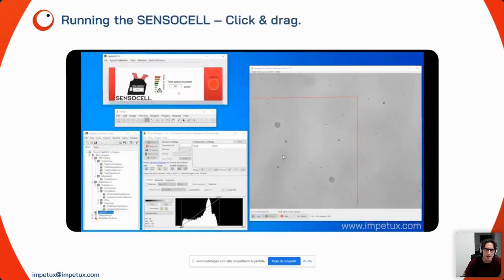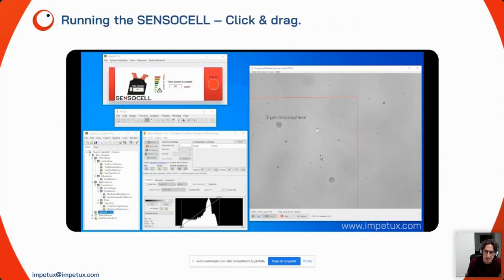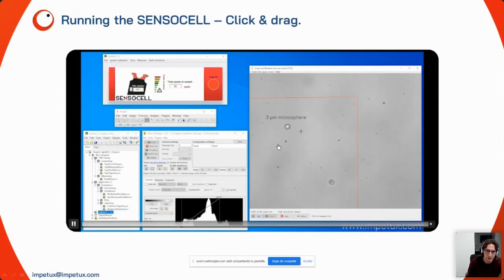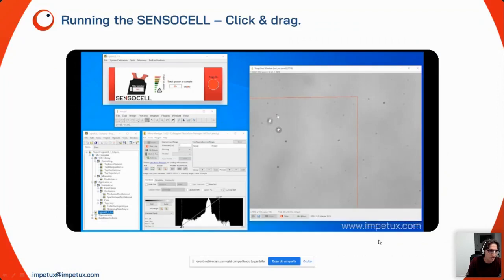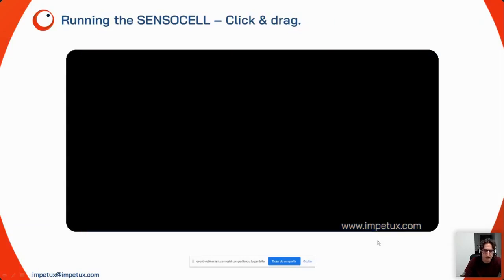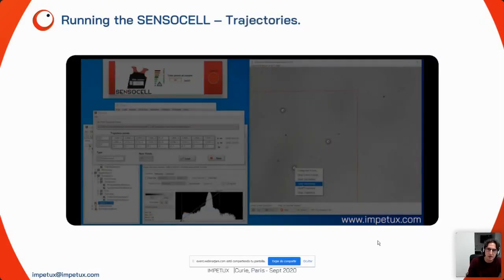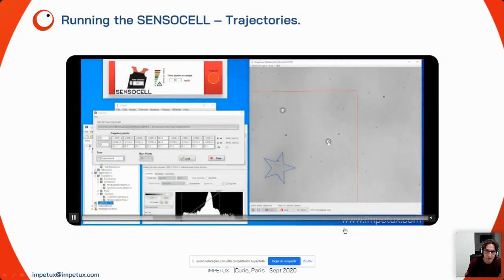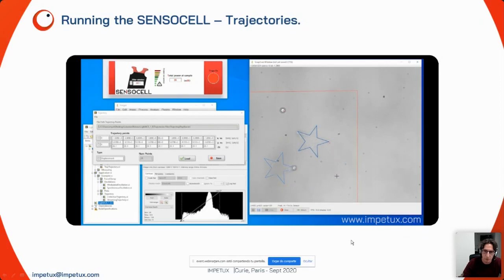Let me show how to generate an optical trap and trap a microsphere in water. This is the most basic form: you click on the screen, an optical trap is generated shown by the red cross, and you trap the microsphere. We generate a second trap to trap another microsphere and drag the cursor to move it around manually. But you can do more than that — you can program arbitrary trajectories, for example a star-shaped trajectory, imposing it on several particles.